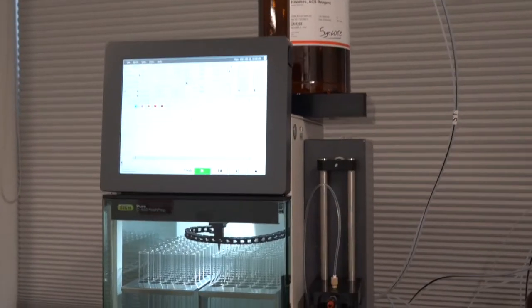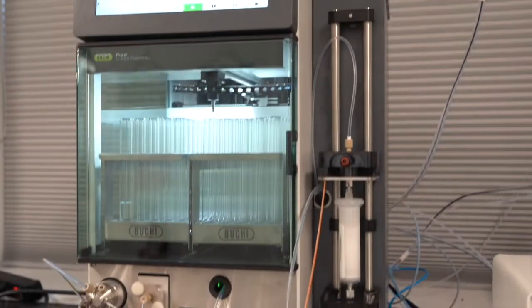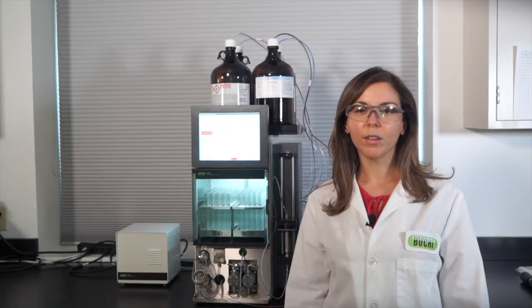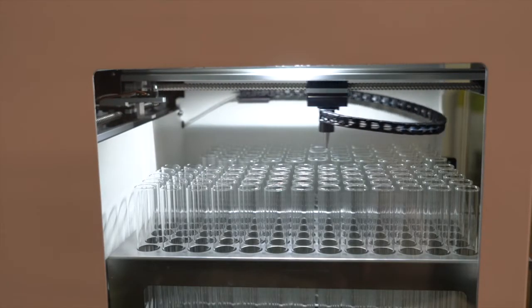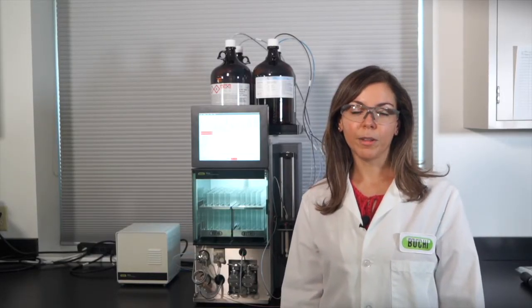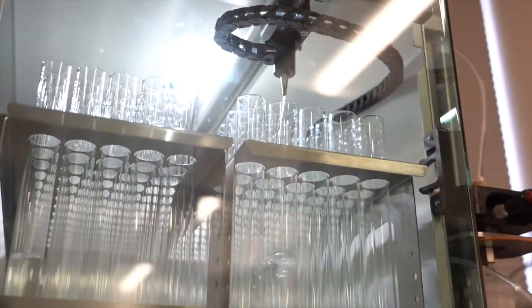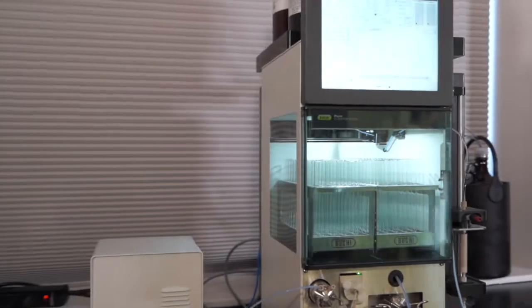Hello, my name is Shuri. Today we will be demoing the C850 that's located here in our headquarters lab in Newcastle, Delaware. This instrument can perform flash and prep purifications with both UV-vis and ELSD capabilities. We will cover both separation techniques in this video and cover all the instrument's advanced features.